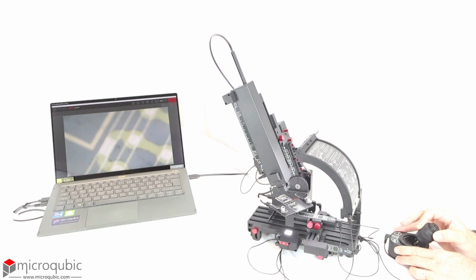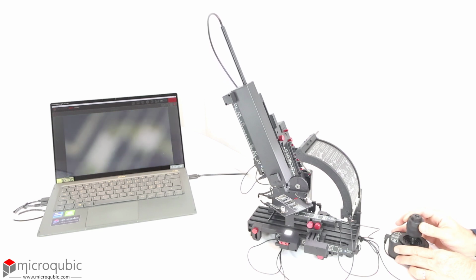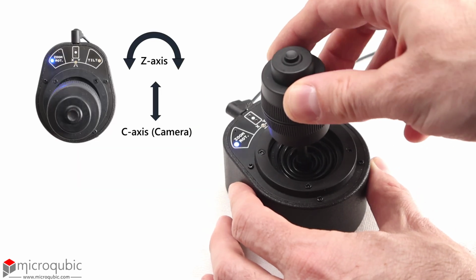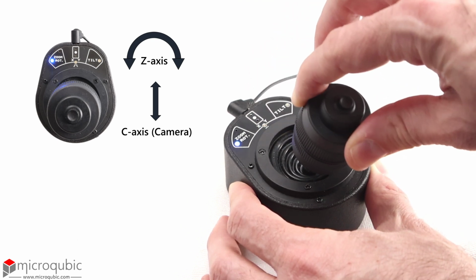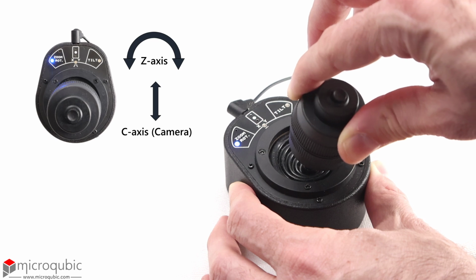In general, the camera axis is used for zooming, and the Z-axis is used for focusing. After some practice, you can control both linear actuators simultaneously to zoom in and out more continuously without losing the focus.